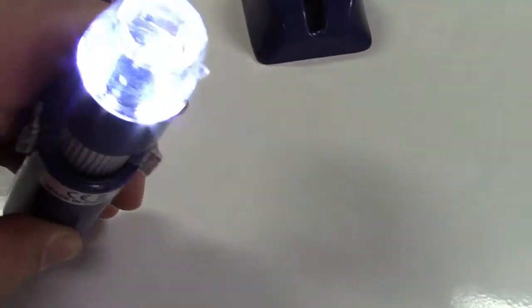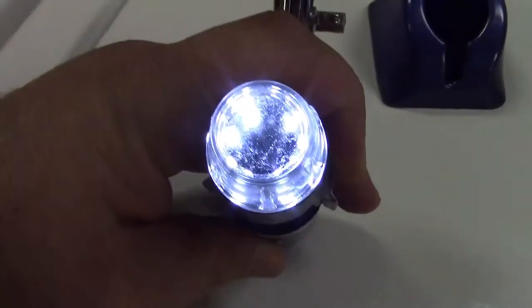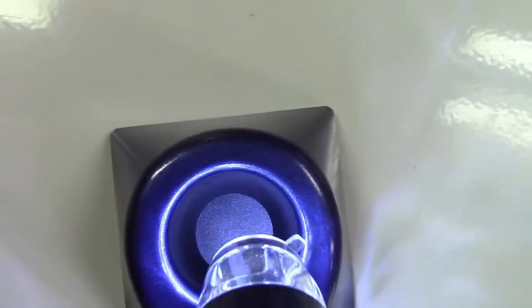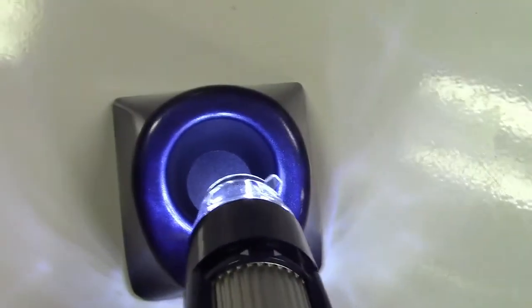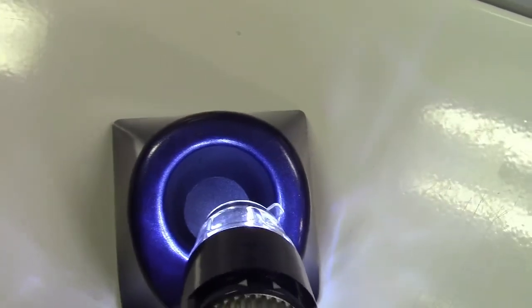If I take the microscope over here and hold the power button down, you can see that it lights up. There are 8 LEDs in there to help illuminate your subject. So if you get that, just to give you an idea what that would do. And there's a little wheel here that you can adjust to dim that or make it brighter. It doesn't go extremely bright, but it's really not necessary for something like this at such a close range. Too much light in this case would actually wash out the picture, so you can adjust it as such.